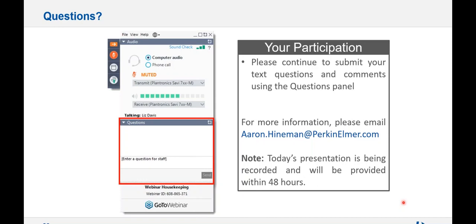We do have documents telling you how to make up the modifier from the solutions that we sell, and it's made up differently for the HGA versus the THGA. The THGA modifier strength is 1/3 the strength of the HGA modifier. So the first thing I would do is make sure that it's made up in the correct strength.